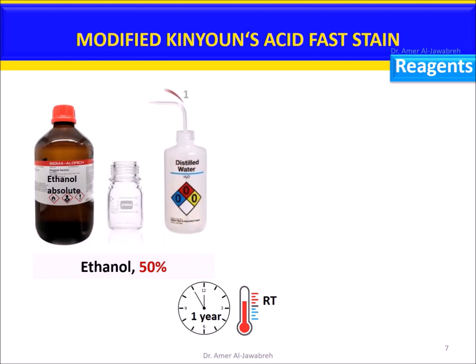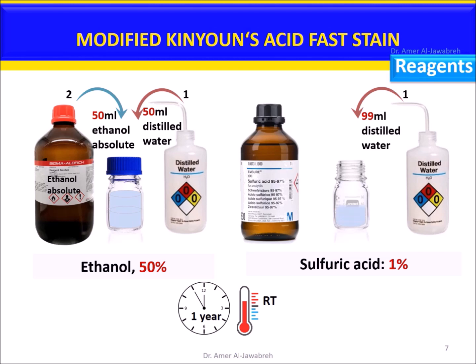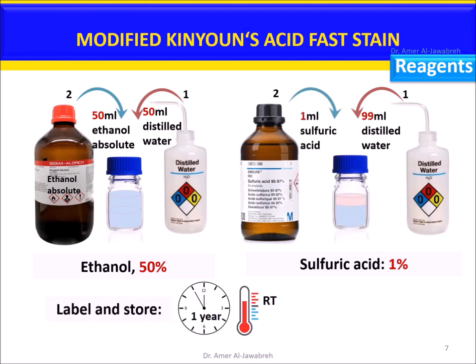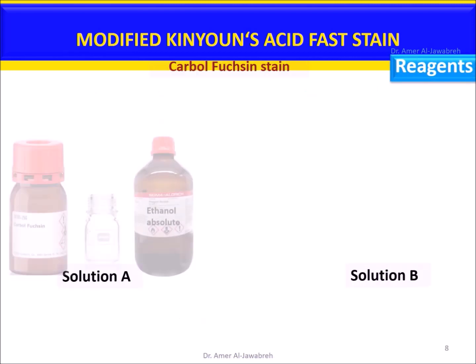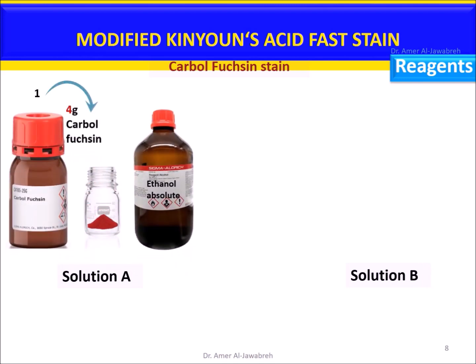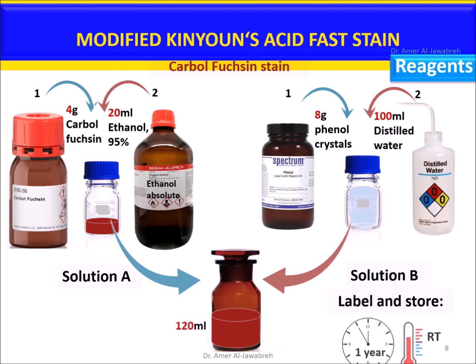Reagent preparation: Prepare 50% ethanol as shown. Prepare 1% sulfuric acid as shown. Label and store for one year at room temperature. For carbol fuchsin stain, prepare solution A and solution B as shown, then mix the two solutions. Label and store at room temperature for one year.